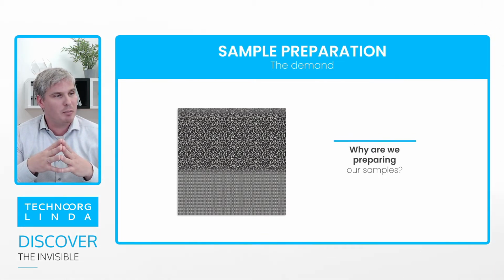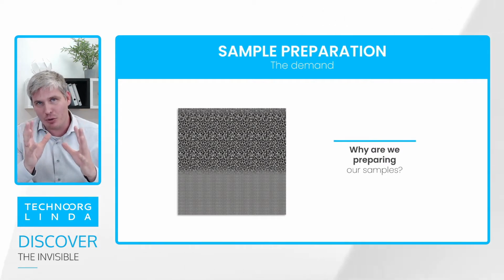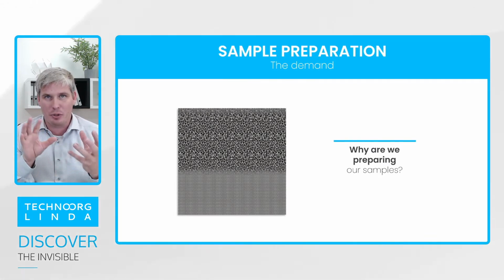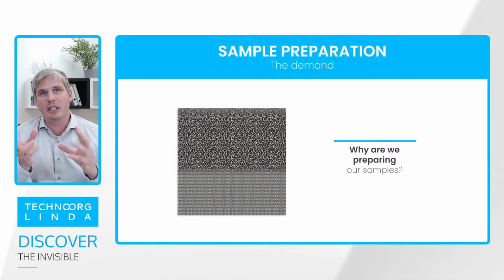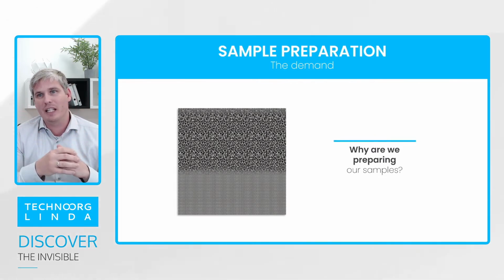And once we remove this amorphous layer, we usually still have a destroyed and modified layer, which can be quite thick actually, modified by the mechanical polishing itself. You can destroy and reorient your crystals, and this covers the real structure you are looking for, and more dangerously, it can give you a false result.